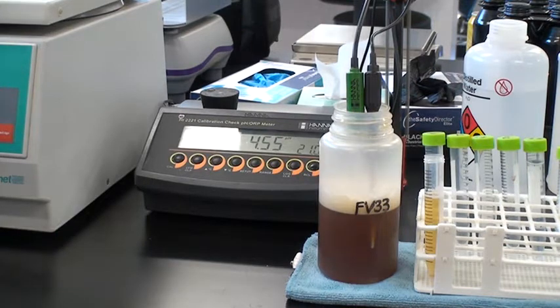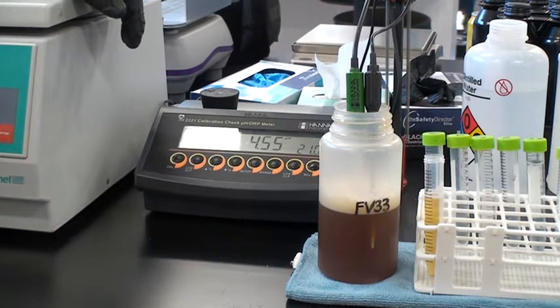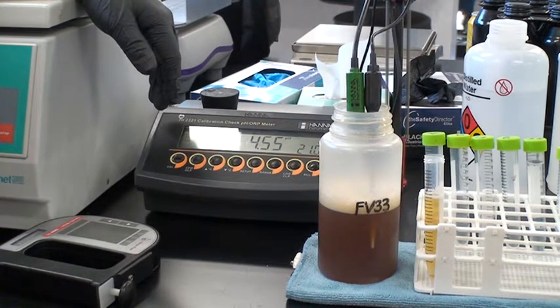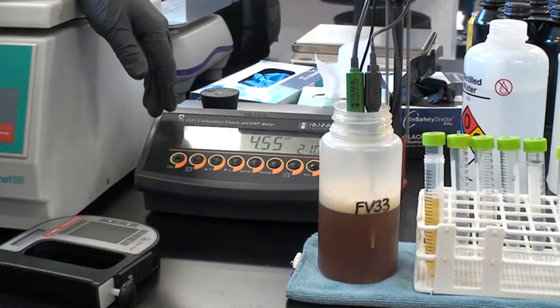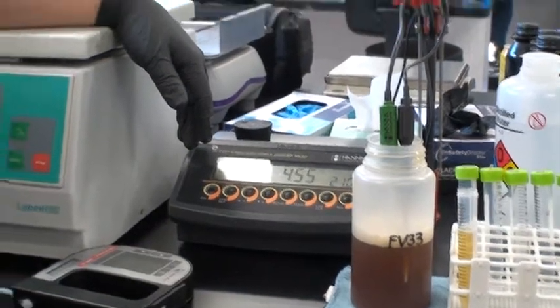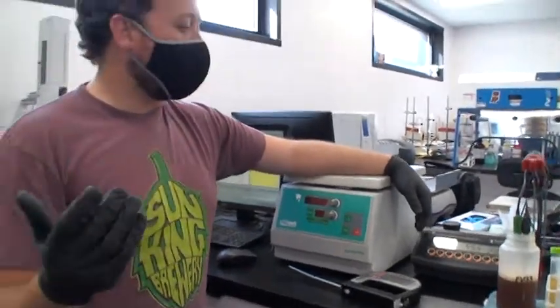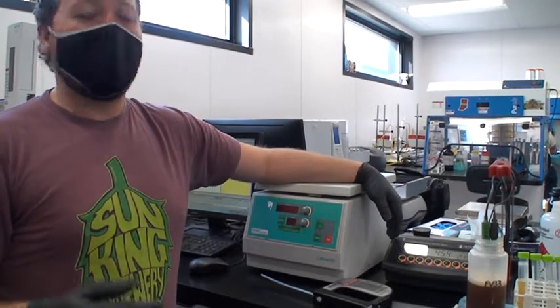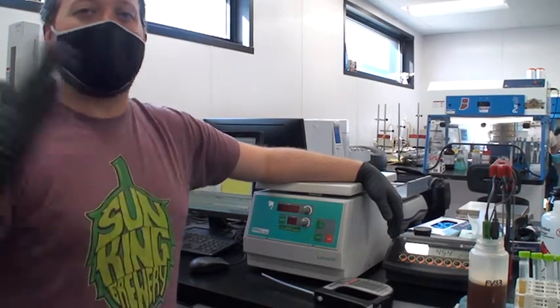Based on experience and tracking this daily, a reading of 4.56 tells you you're right on track. If you're not on track, it depends: when you mash in a beer, the mash pH is around 5.2 to 5.4. After chilling and adding hops, in the fermenter before pitching yeast, pH typically drops from 5.3 to 5.0. So 5.0 going into the fermenter is right. If it's still at 5.0 on day one, the yeast aren't doing their job. If the pH went up, that could mean cleaner or caustic residue is still in the tank — a bigger problem to deal with.